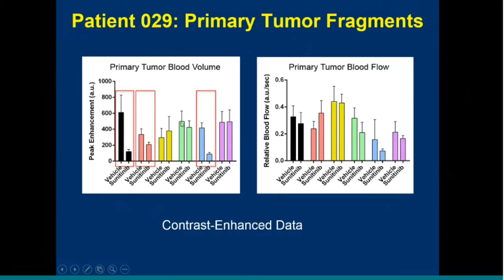It isn't clear which of those 2 cases is happening, or if both cases are happening. And secondly, it's also not clear which of those 2 would be better for RCC patients, where anti-angiogenic agents are used quite often as a monotherapy. Is vascular normalization better in that case, or is vascular obliteration better? It's not quite clear. So we often opted to be a bit conservative here, and we include the blood flow data for completeness, but we're not actually drawing any conclusions from it.